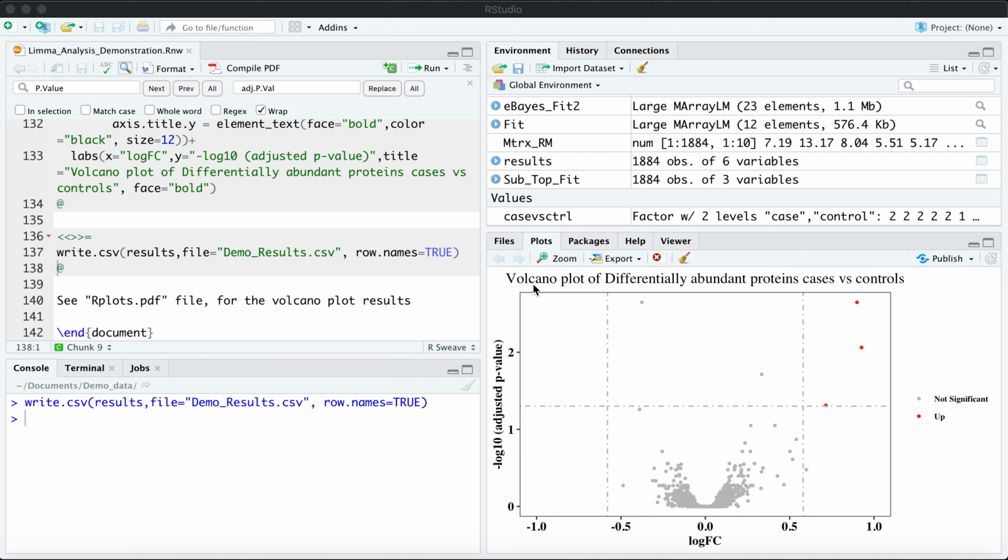So a way to do that, there are of course several tools to do this task, but one tool is Ingenuity Pathway Analysis, or IPA, and it's the one that we are going to present to you in this hands-on demonstration on how to use IPA.